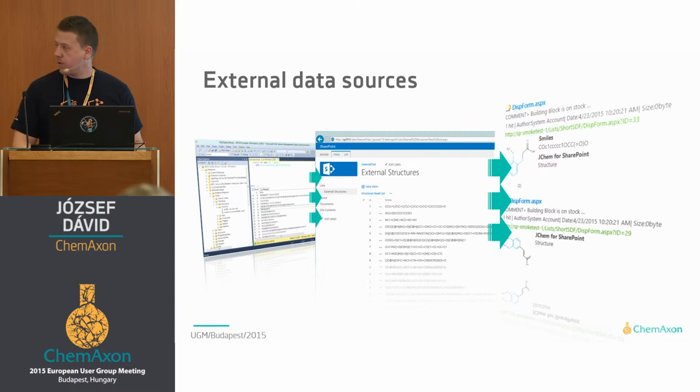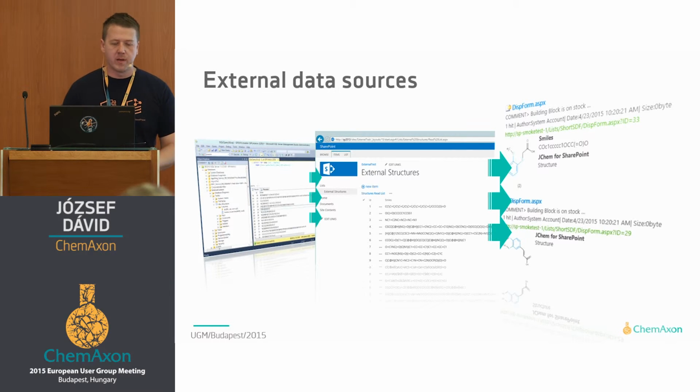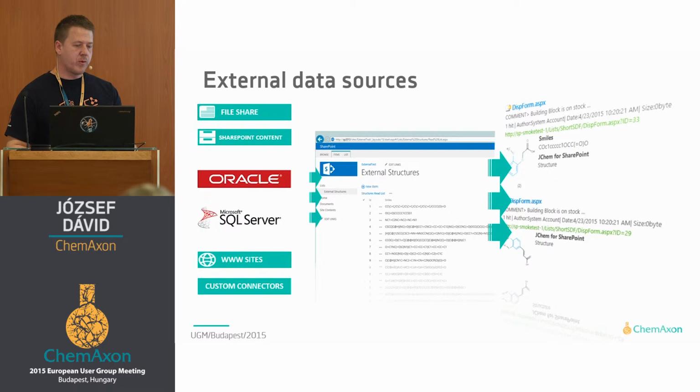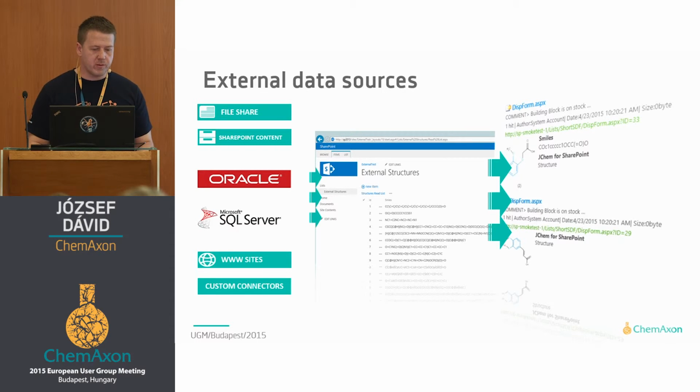But that's not the only opportunity you can have in SharePoint. You can even connect your external data to SharePoint. At the moment, what we support are file shares, other SharePoint content, so not the same, because that's obvious, but other SharePoint form content could also be connected to this particular form, Oracle or SQL servers, and websites, and of course you can write your own custom connectors if you have a special business application you would like to connect.